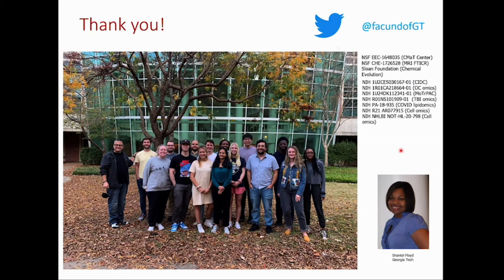So it is possible, but we try not to, because the paraffin and the embedding material really interfere with the measurements. Our favorite way of preserving tissues is simply flash freezing. So the short answer is we'd rather not. But if you have an incredibly precious sample, we can try. It's possible, but we'd rather not do it. So flash freezing for solid tissues.